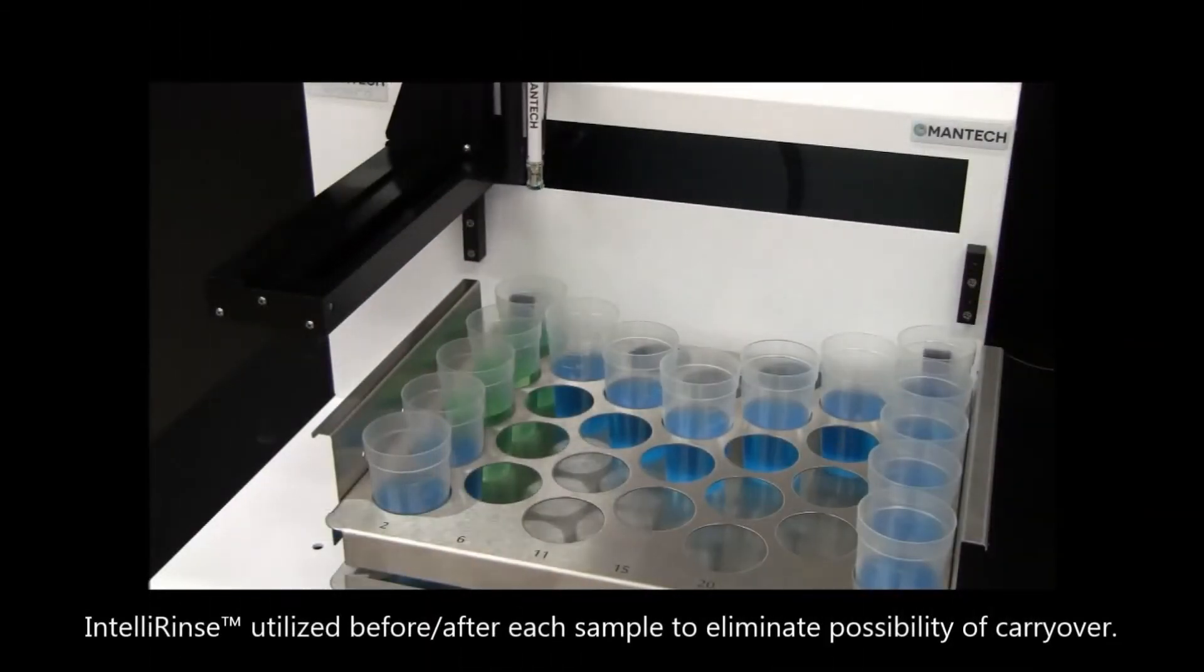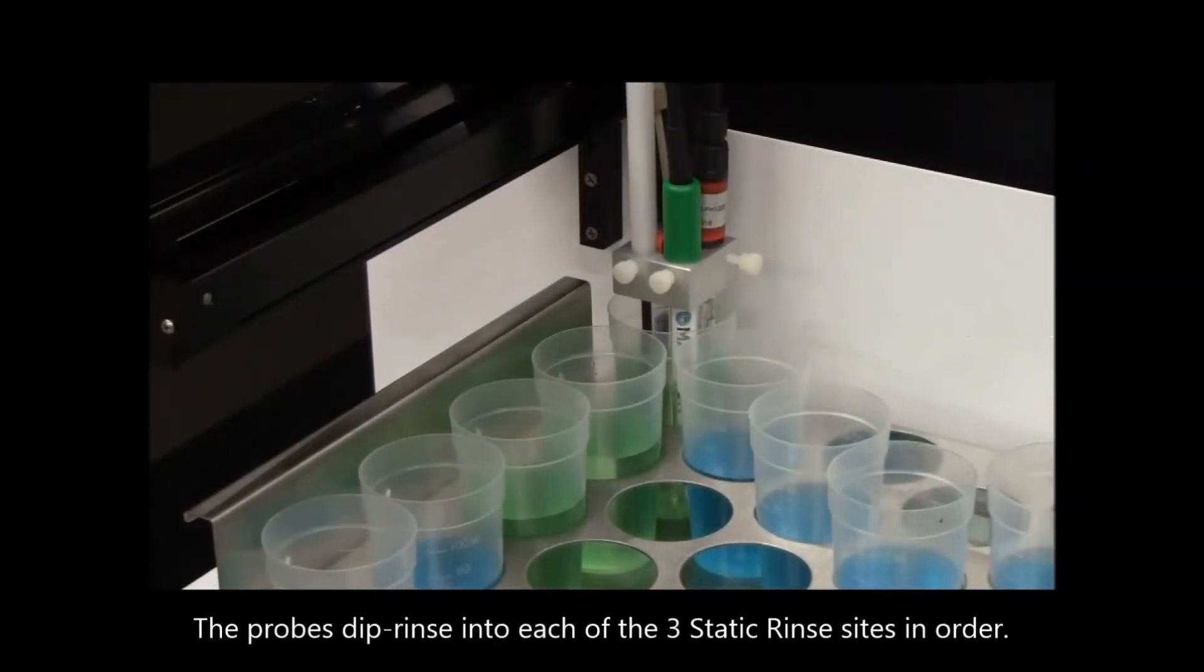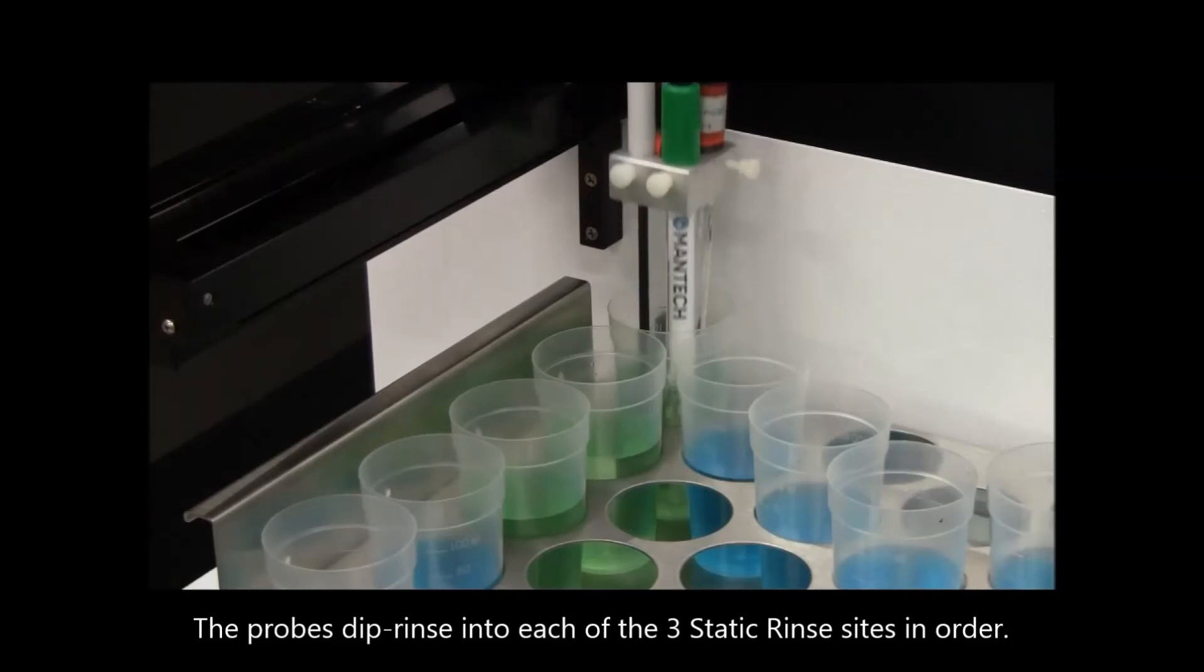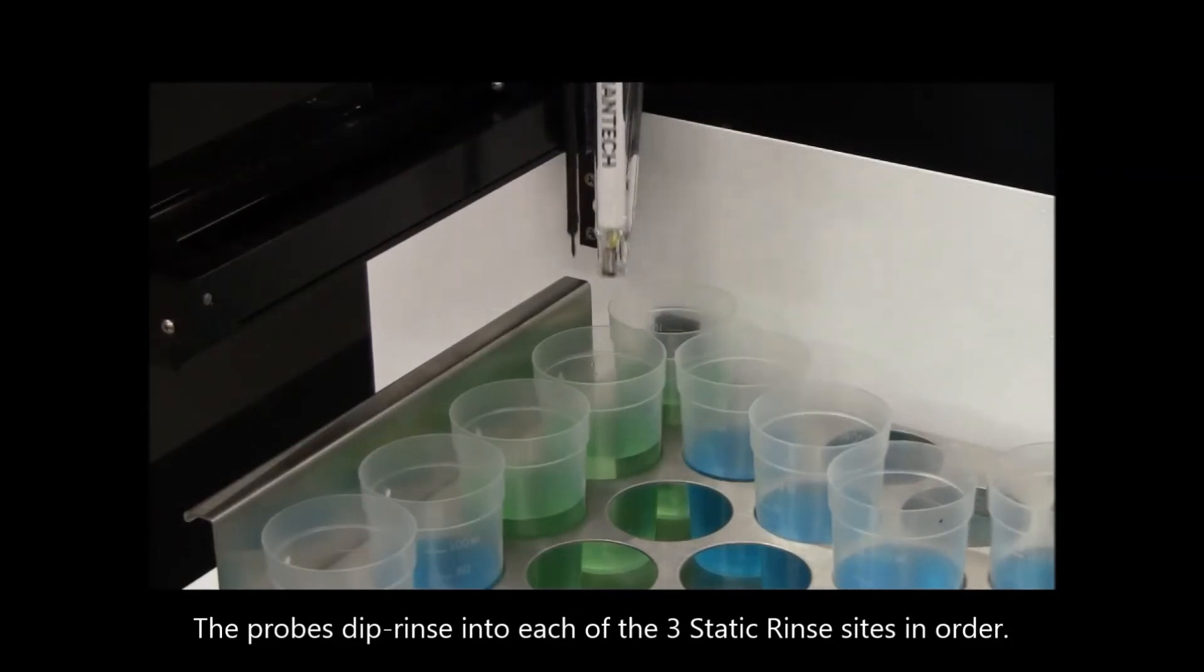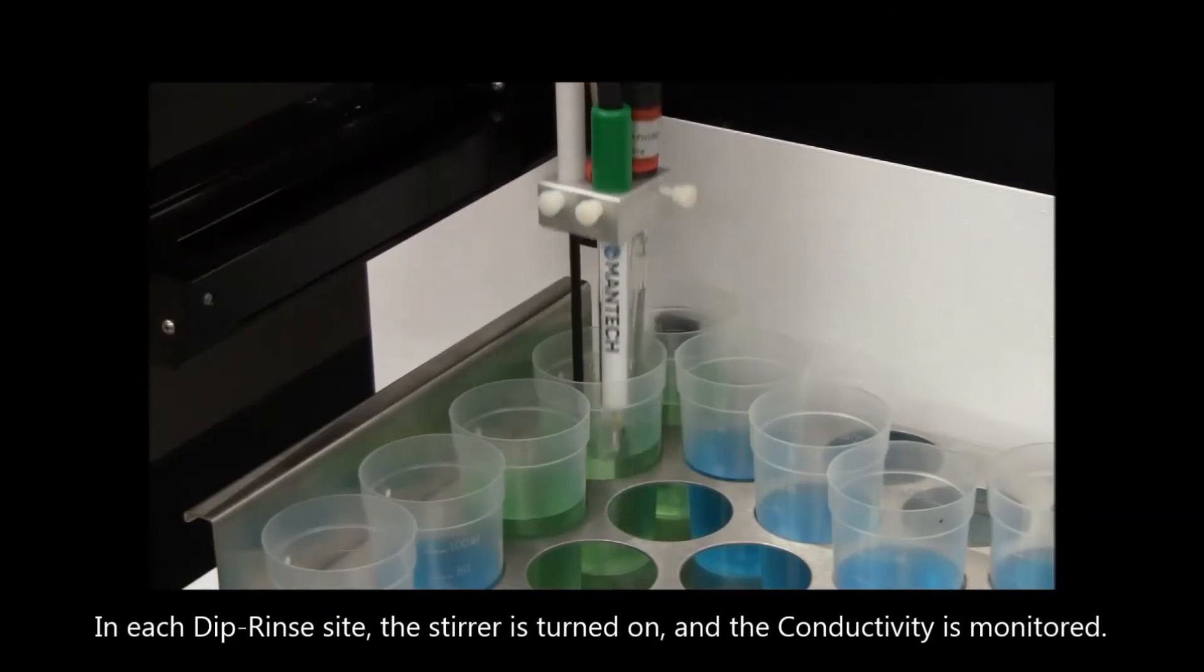IntelliRinse is utilized before and after each sample to eliminate carryover. The probes dip rinse into each of the three static sites in order. In each dip rinse site, the stirrer is turned on and the conductivity is monitored.